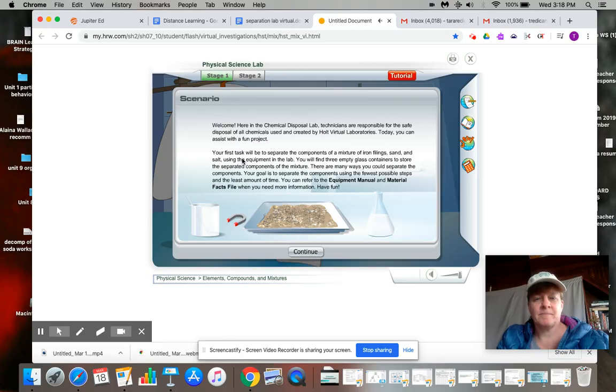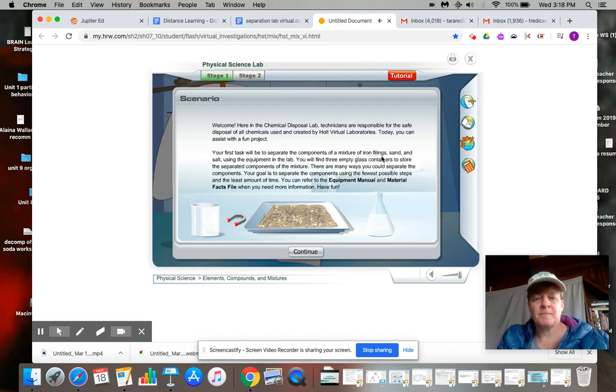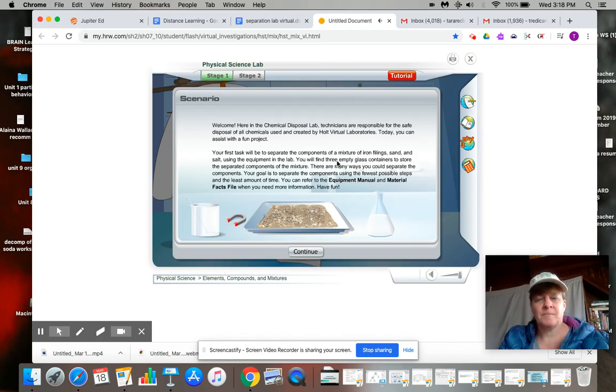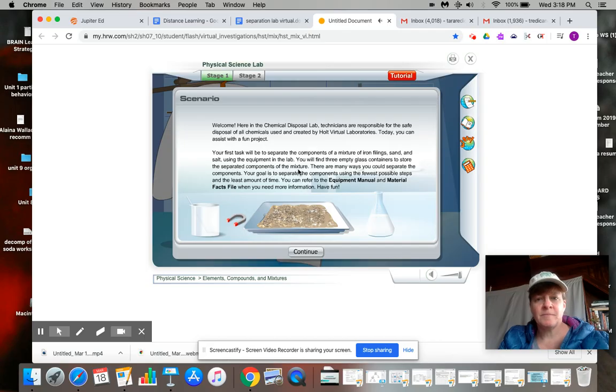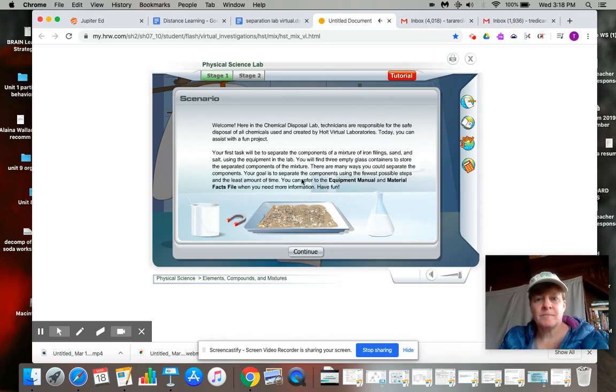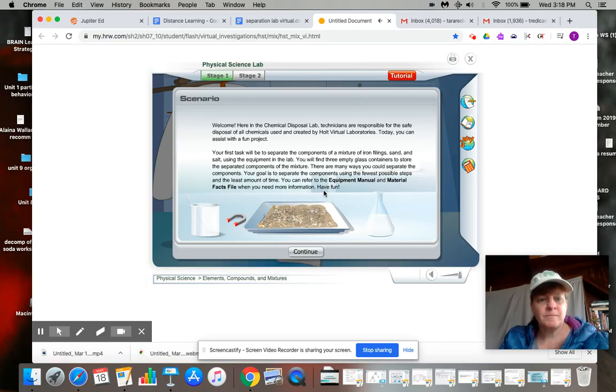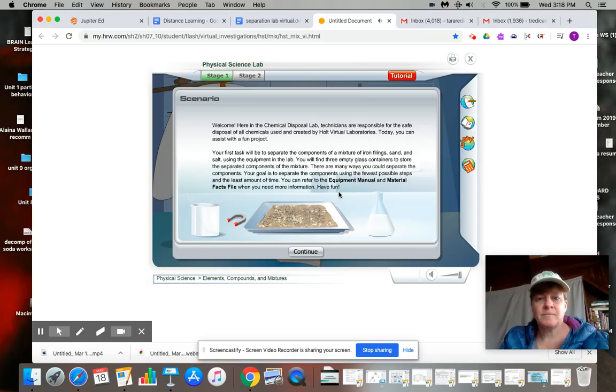Your first task will be to separate the components of a mixture of iron filings, sand, and salt using the equipment in the lab. You will find three empty glass containers to store the separated components of the mixture. There are many ways you could separate the components. Your goal is to separate the components using the fewest possible steps and the least amount of time. You can refer to the equipment manual and material fax file when you need more information. Have fun!